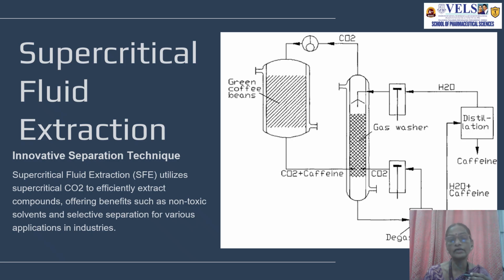This is the assembled apparatus. Here, it is called a still, where coarsely powdered plant material is taken. Then carbon dioxide from the gas generator is supplied. The pressure can be adjusted. Due to the pressure valve adjustment, the carbon dioxide becomes a liquid. With liquid carbon dioxide, penetration is more efficient, with more diffusion and penetration properties to disturb the cell wall, thereby increasing the extraction process.